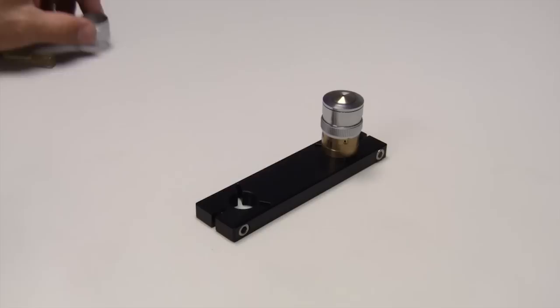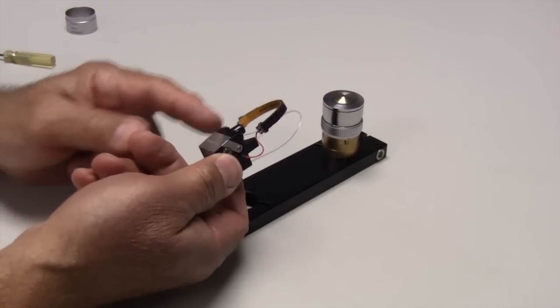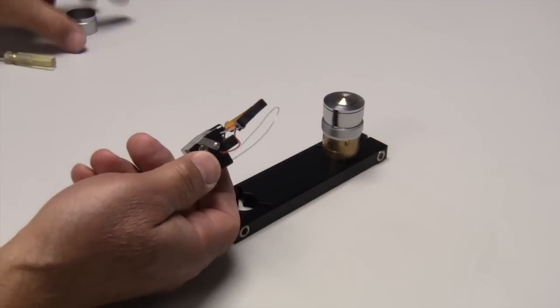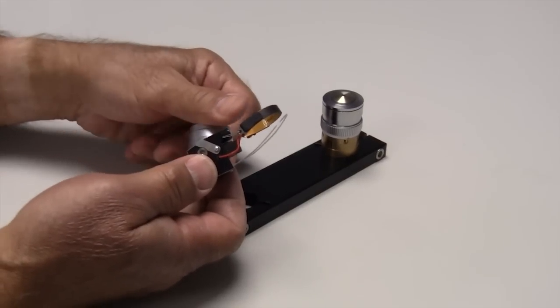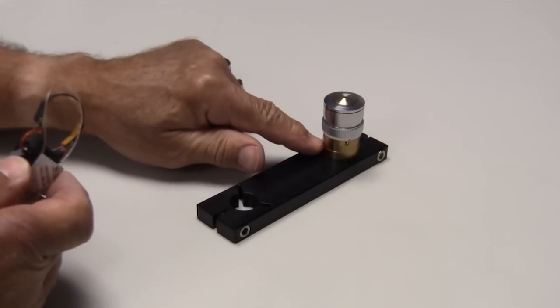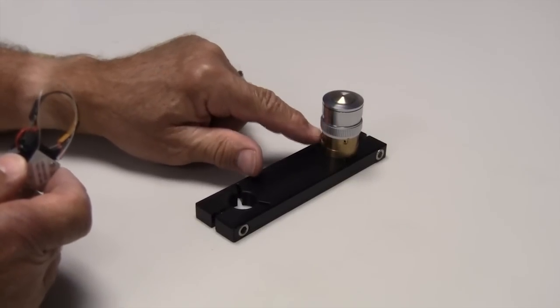Here we're going to attach a bioptics objective heater onto a Leica objective that's had the collar removed from the bottom. This was necessary to have direct contact with the brass of the objective.